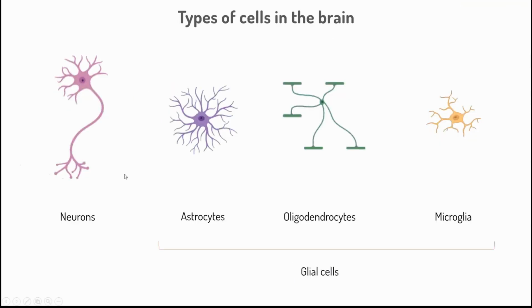So typically, I don't know if you see my cursor here. Normally we have the neurons. I mean, people are most used to thinking about the neurons when they study the brain. But here in Achucarro, and most of the work I will present today at the end of the talk, when I present our results, is about the glial cells, which are basically, there are more, but the basic ones are astrocytes, oligodendrocytes, and microglia.